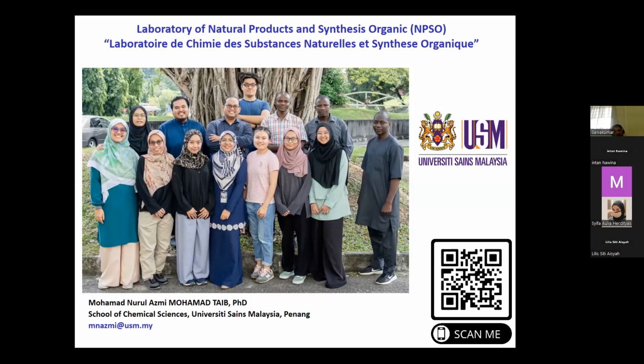It's quite challenging if you are doing natural products. One way is you can look at the splitting patterns in the proton NMR, and also the integrations. If you pick any peak as a reference and you see other integrations below 1, it means they are impurities or your compound is not pure. The easiest way is to run your sample with carbon first.